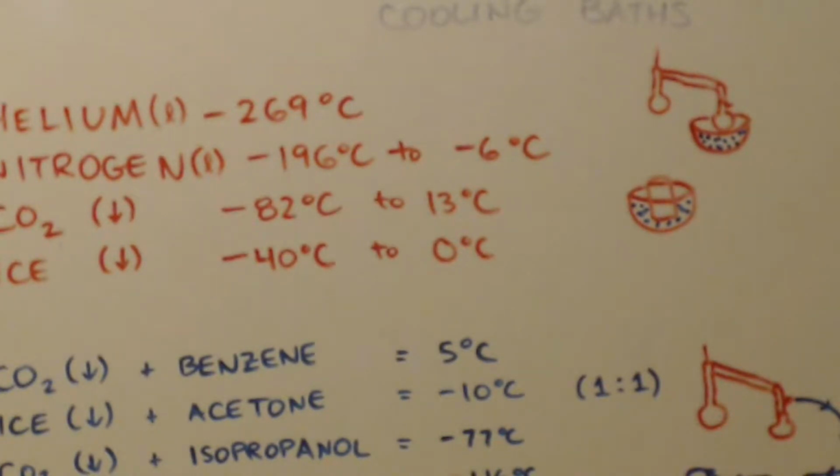And I used to know about when I first read about dry ice and using it. I really at first didn't understand what they meant. What do I do with the dry ice? Because dry ice is a certain temperature. I think it's like minus 109 Celsius, or I'm not sure. But how do you get the different temperatures? What if I need to be at minus 10? Or what if I need to be at minus 77? How do I get it to be exactly a smooth temperature, like throughout the whole reaction?